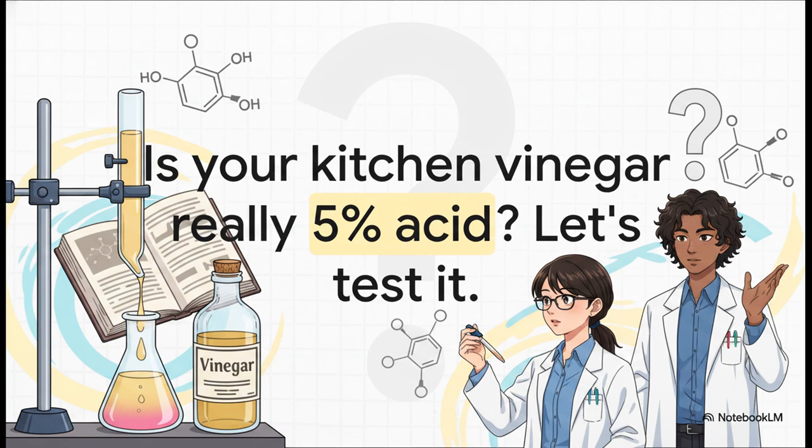So here's the big question to kick us off. Is your kitchen vinegar really 5% acid? You know, the bottle on the grocery store shelf proudly states it is. But as scientists, we don't just blindly trust a label, right? We test it. Today, we're proposing a totally hands-on scientific investigation using analytical chemistry to find out the absolute truth about what's inside that bottle.